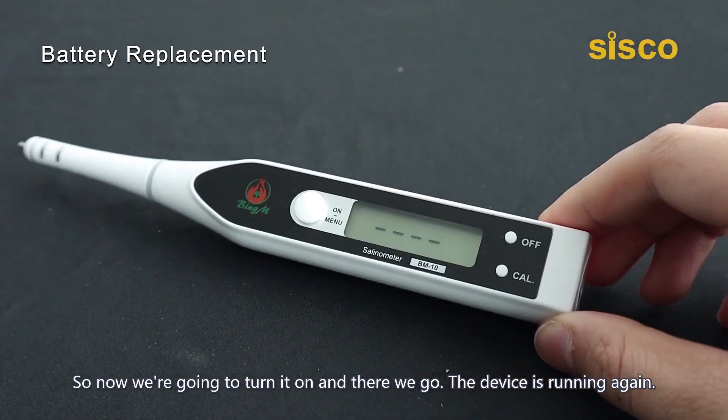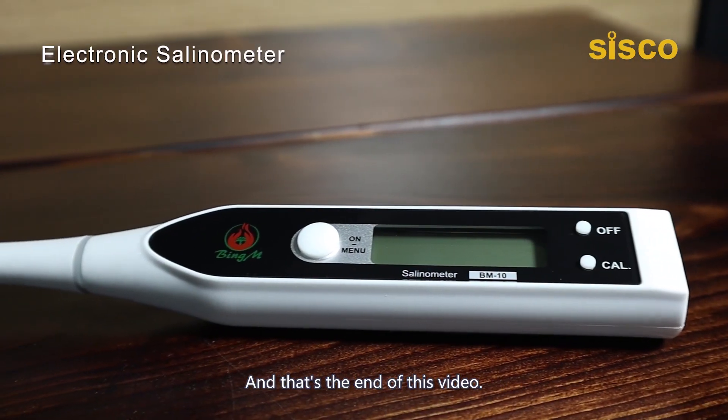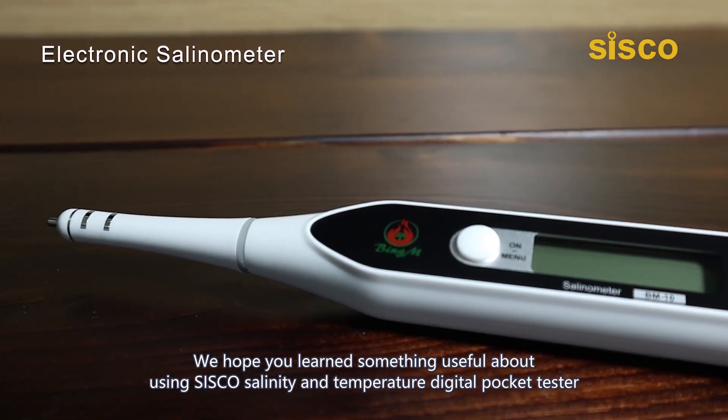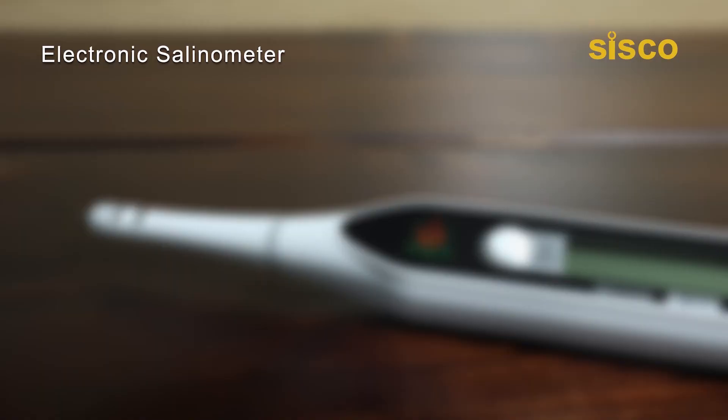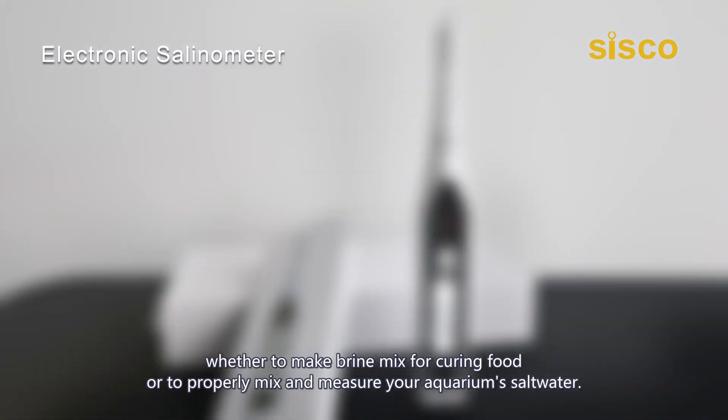Now we're going to turn it on — and there we go, the device is running again. That's the end of this video. We hope you learned something useful about using SISCO's Salinity and Temperature Digital Pocket Tester, whether to make brine for curing food or to properly mix and measure your aquarium salt water.